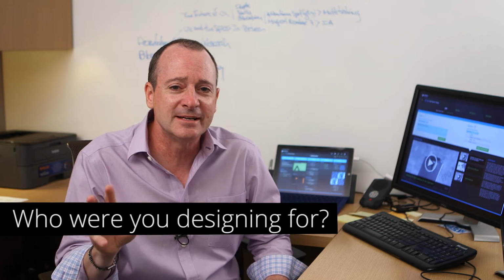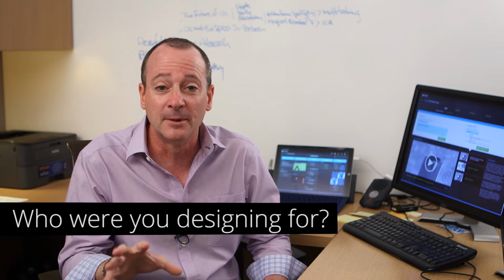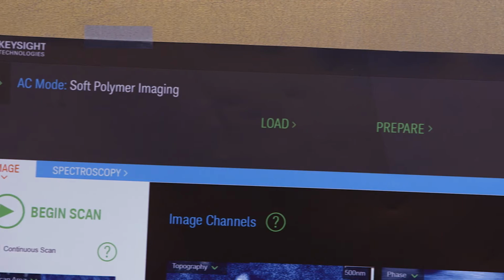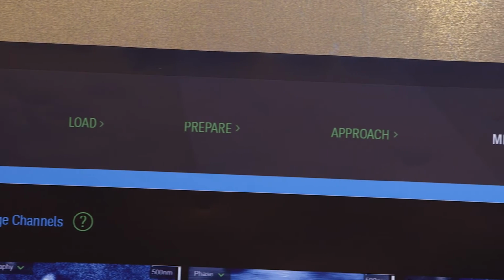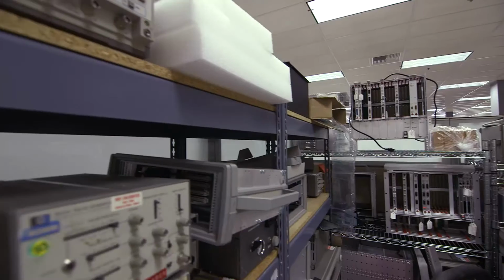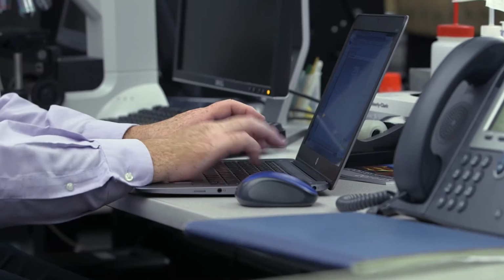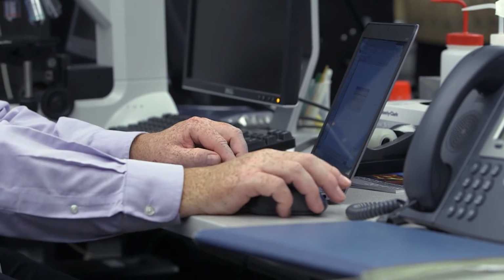Our design needed to support the workflows of multiple types of users. Physicists and chemists with a long history of using the application, and in some cases helped design the original version, needed to be able to transition seamlessly to our new design. New academic users and technical support staff who were familiar with the purpose of an atomic force microscope but not with the application that controls it also had to be considered.